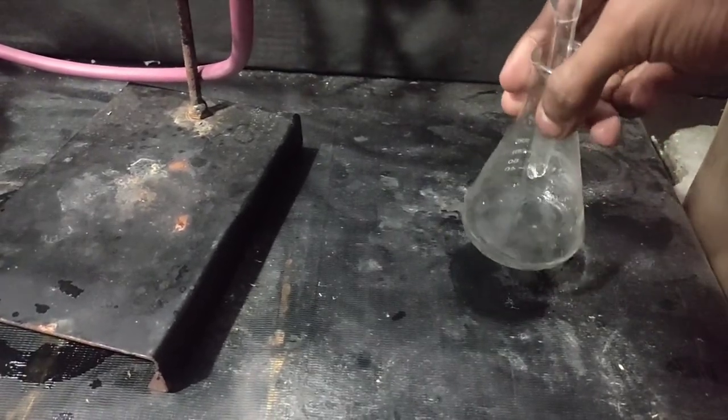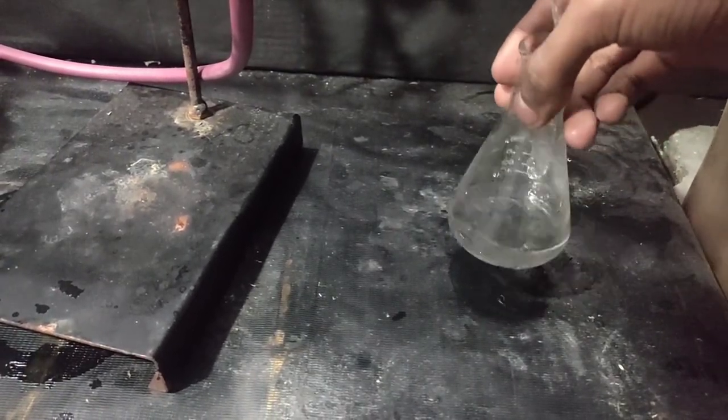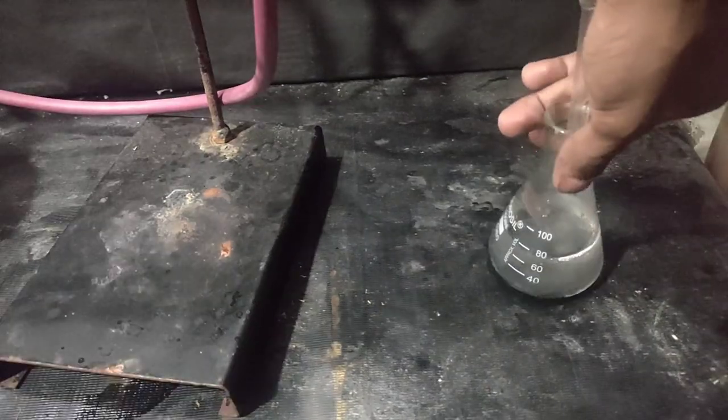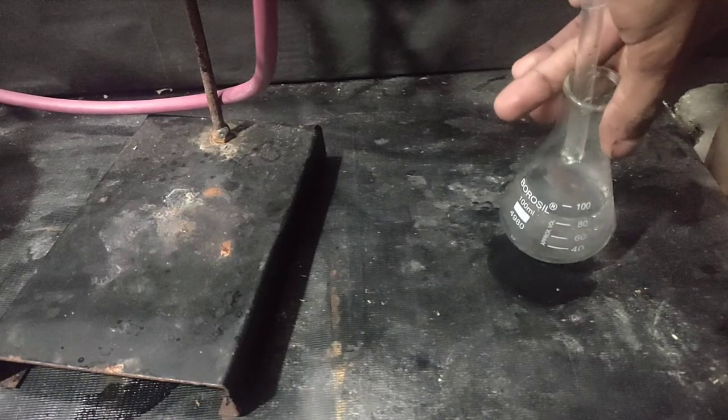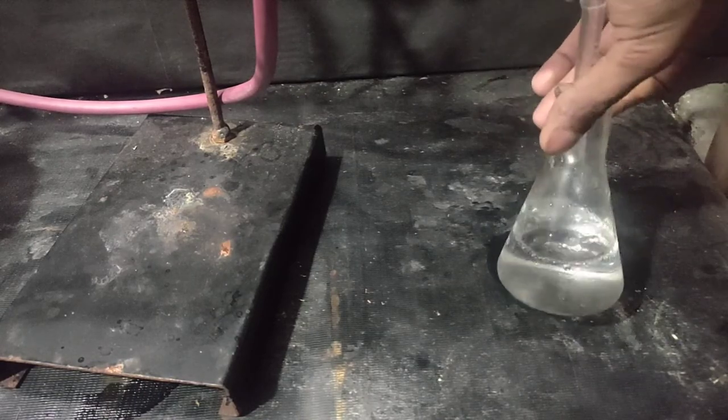On swirling the flask, I could see the formation of some oil drops. After collecting 80ml of distillate, on swirling the flask you can see that there is an oily layer on top of it.